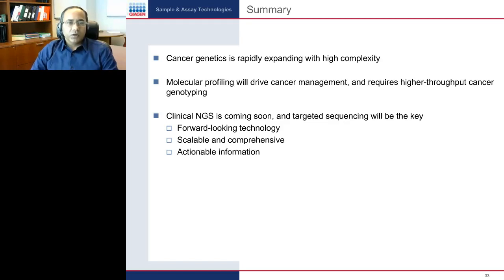The next question is, are there any automated platforms that use the QIAGEN GeneRead protocol? Yes, there are. If we are talking about QIAGEN library preparation, we have QIAcube, which can be used to automate QIAGEN library preparation. And I think that's pretty much it.